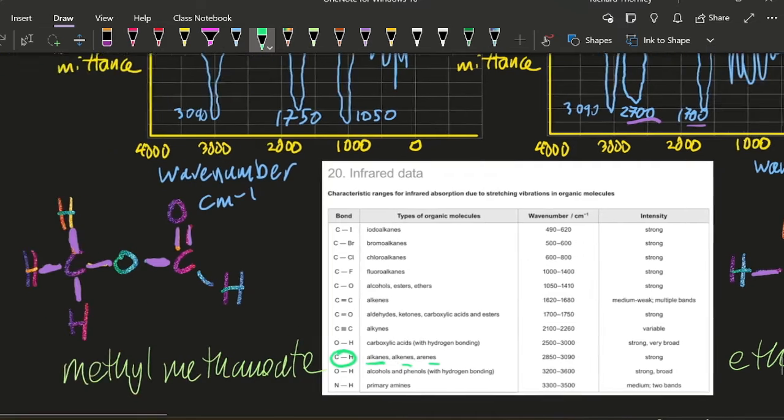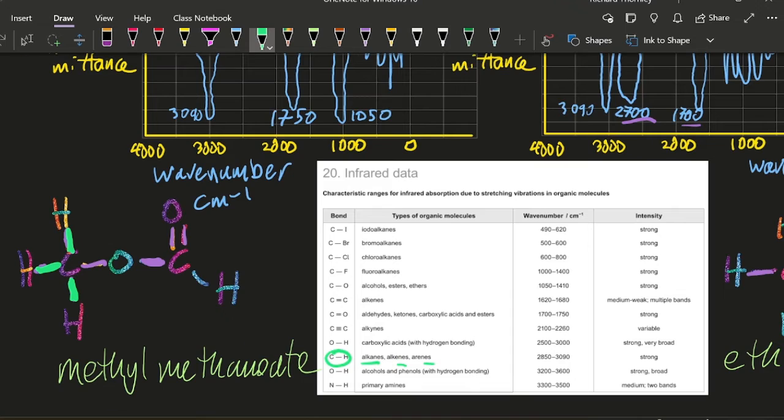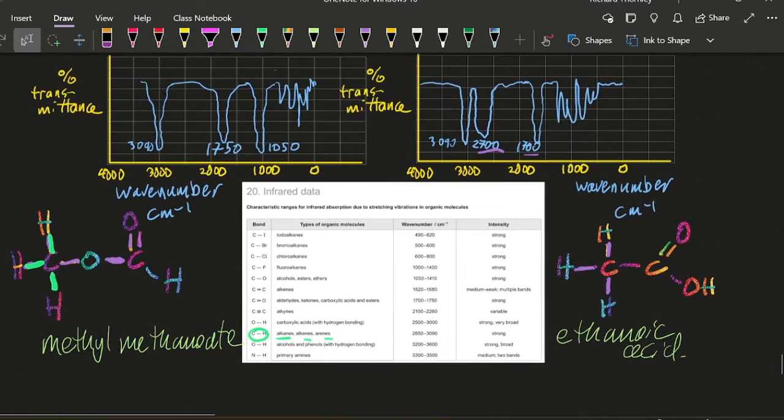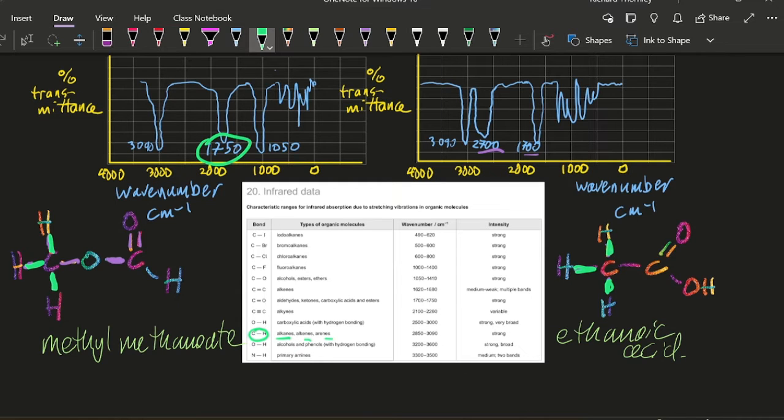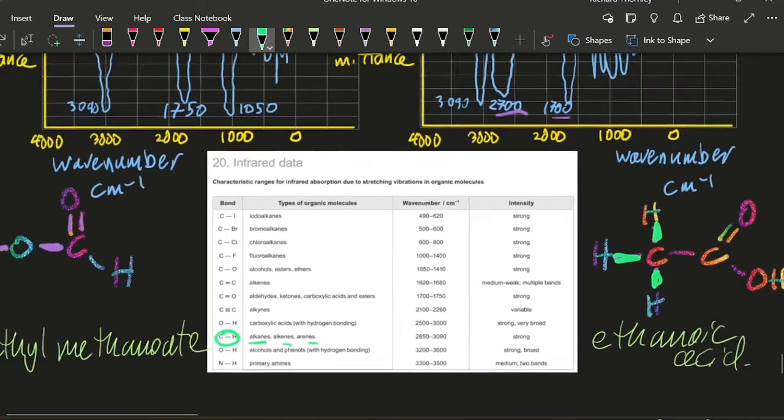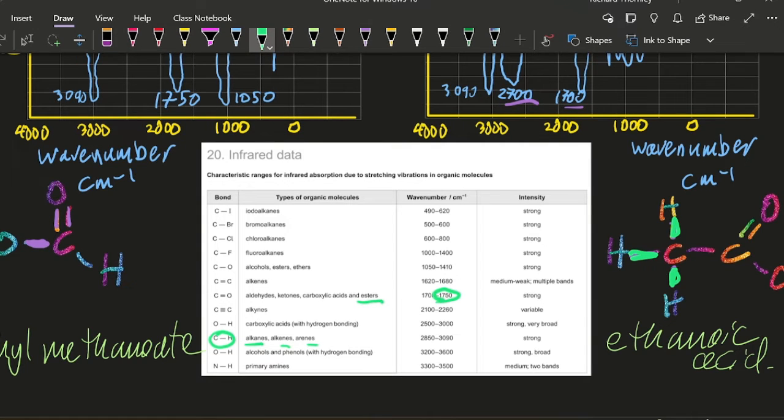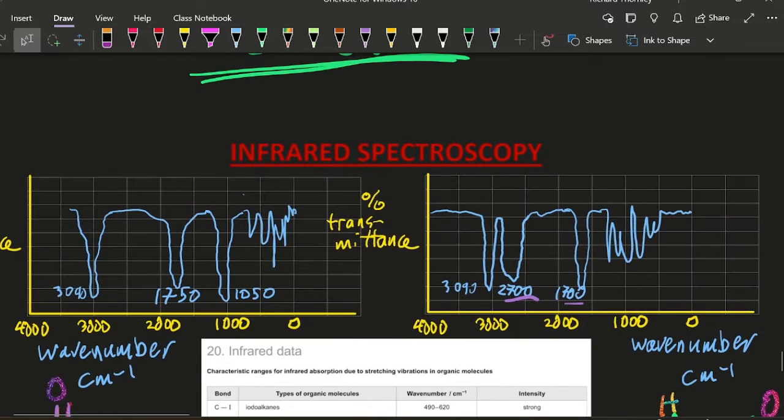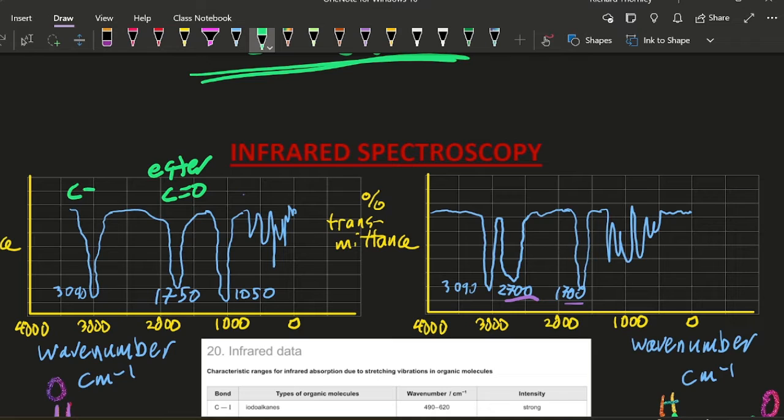Okay. So we've got this bond here, this bond here, this bond here dealt with. And also over here, these three bonds are dealt with. Now we've got 1750. 1750 is that one there. So that's going to tell me it's an ester. C double bond O. Lovely. So that's C double bond O for an ester.